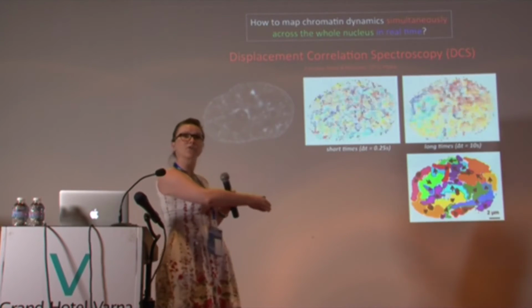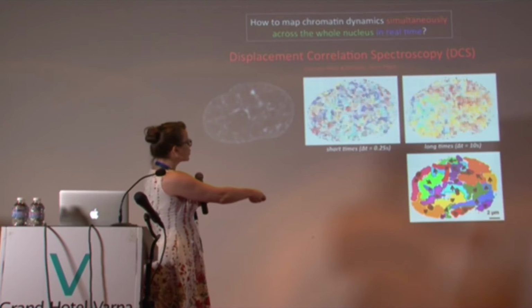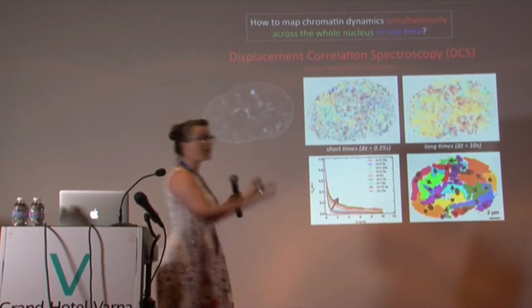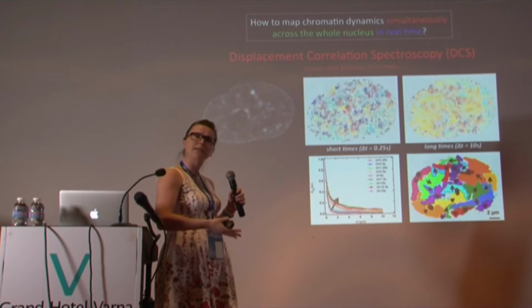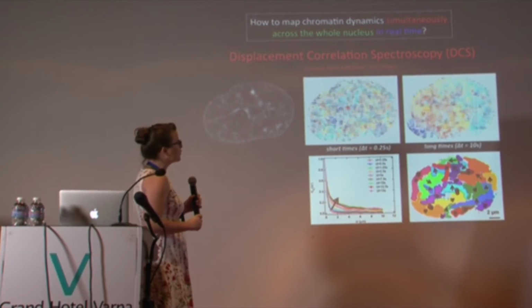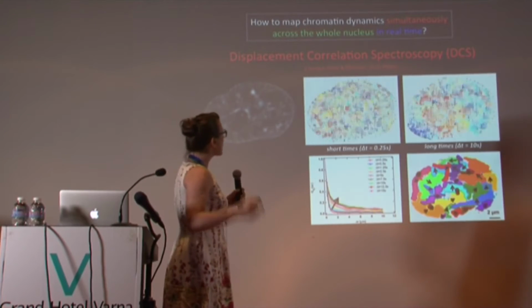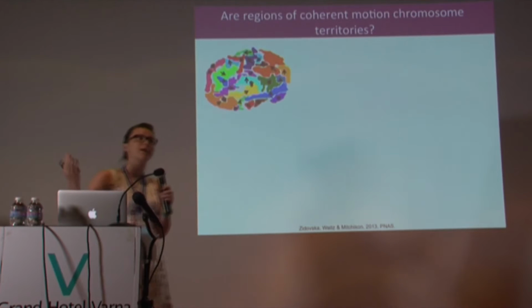My vectors are here color-coded by direction. So you start to see these patches of the same direction, which I have outlined in this picture. And as Peter has already shown, by calculating the spatial autocorrelation function, we can actually detect the size of these regions of coherent motion at different time scales. So we have asked ourselves, obviously, what do these regions mean? Where do they come from?